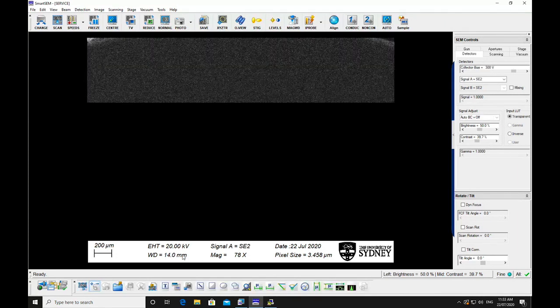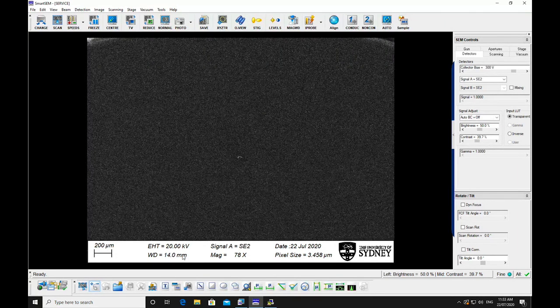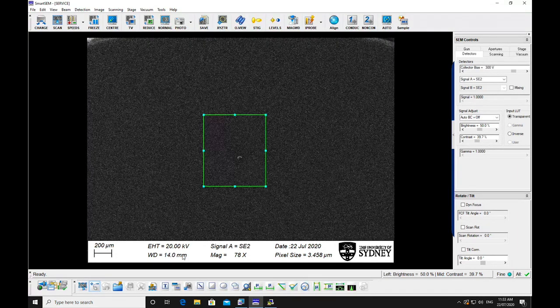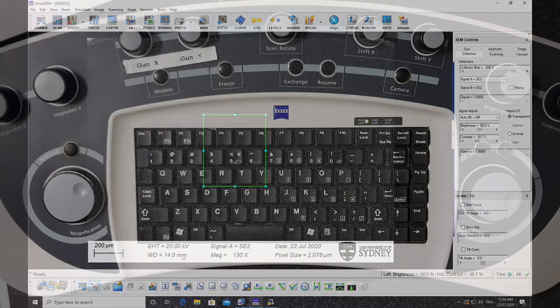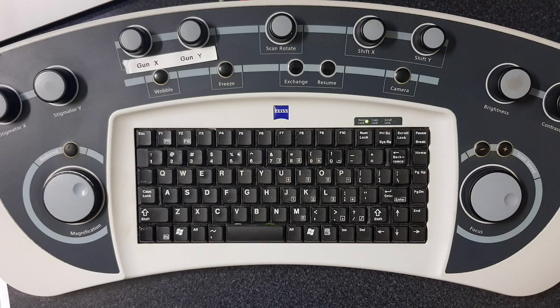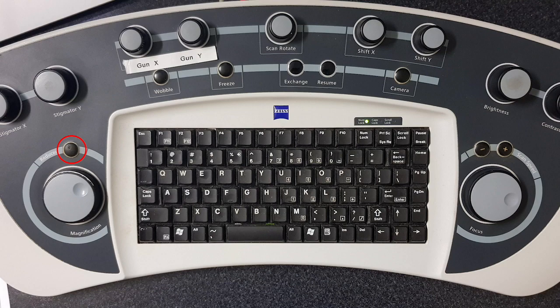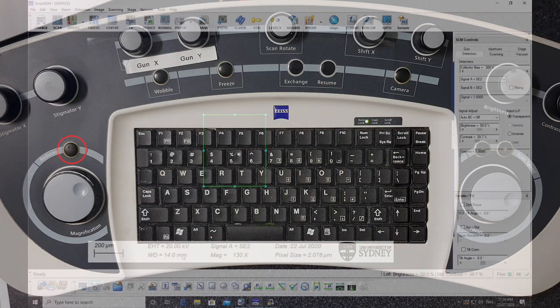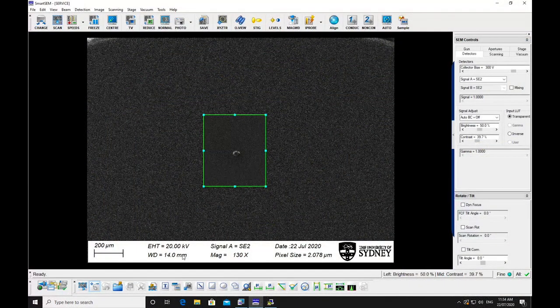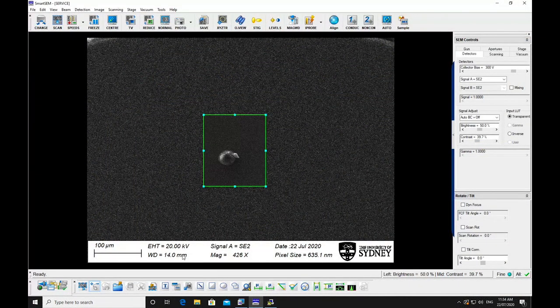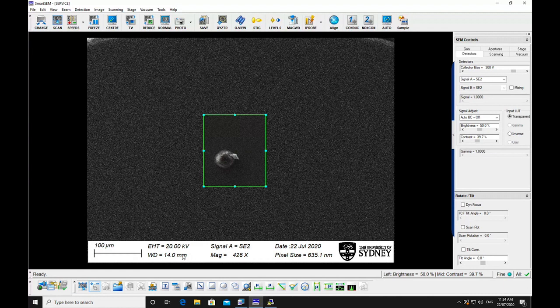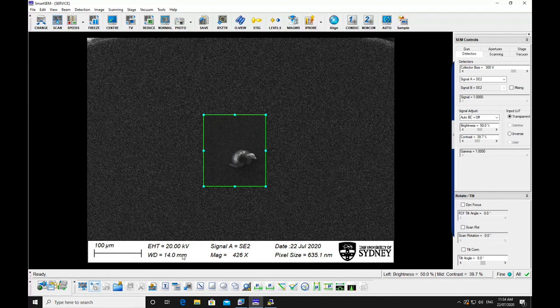Refocus the image and adjust for stigmation at higher magnifications. Use the reduced area scan by selecting reduced on the hard panel. And selecting a slower scan speed will make the focusing easier at higher magnifications.